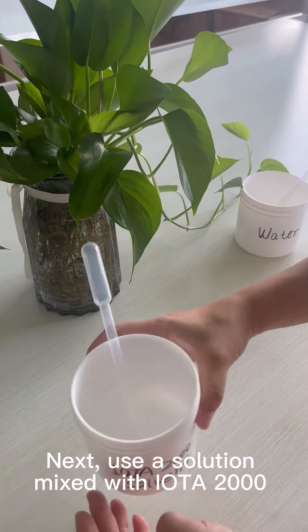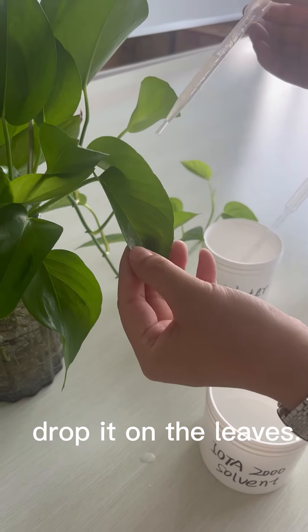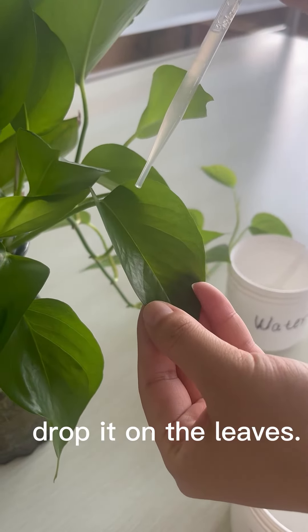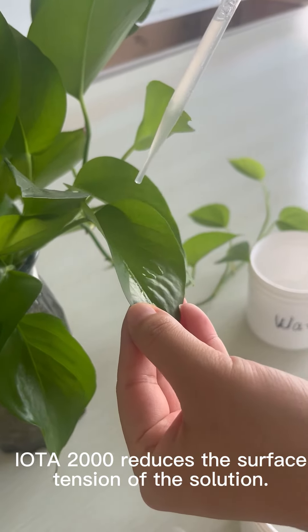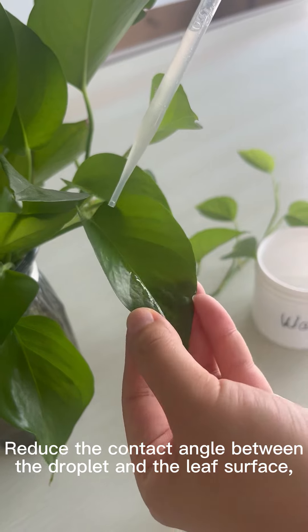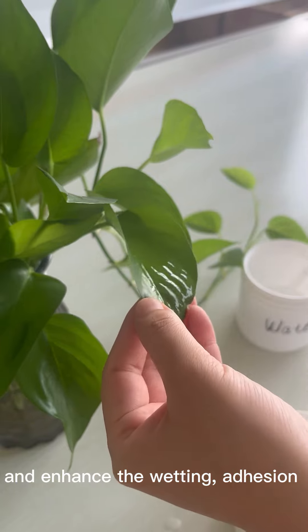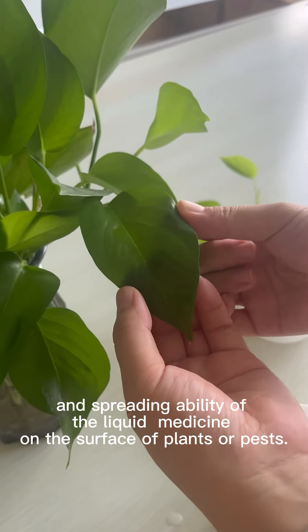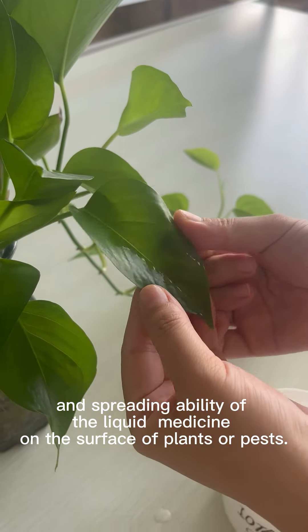Next, use a solution mixed with IOTA 2000 and drop it on the leaves. IOTA 2000 reduces the surface tension of the solution, reduces the contact angle between the droplet and the leaf surface, and enhances the wetting, adhesion, and spreading ability of the liquid medicine on the surface of plants or pests.